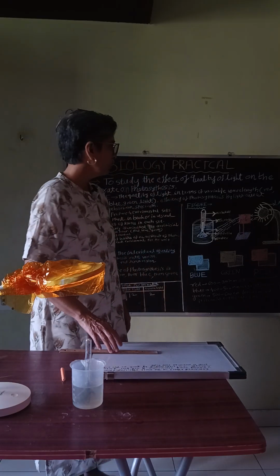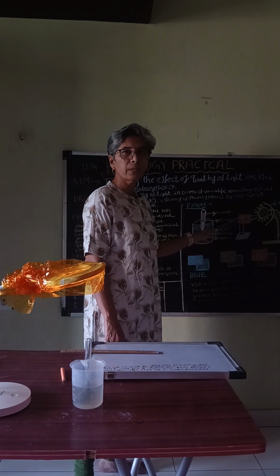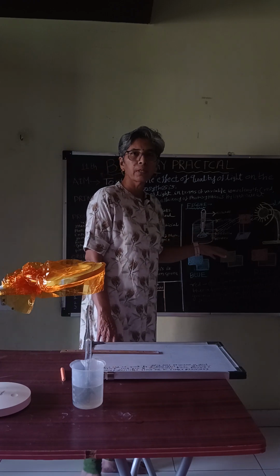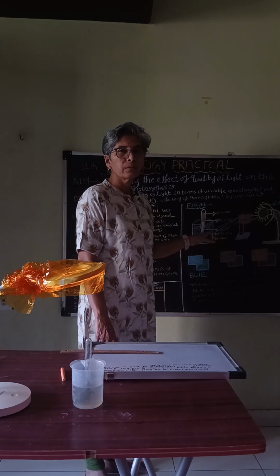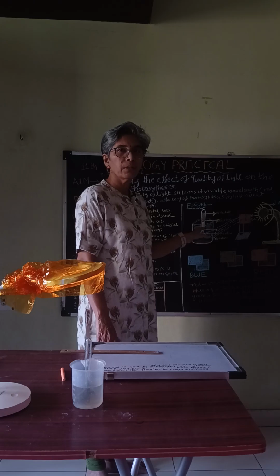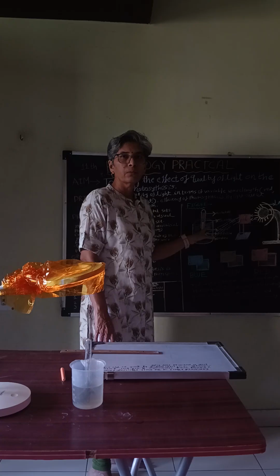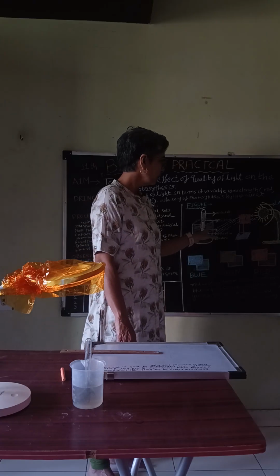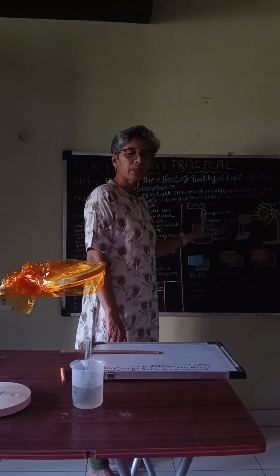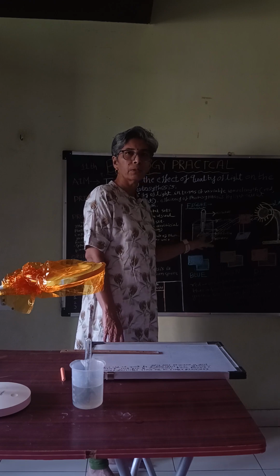So the requirement for this setup is beaker, funnel, test tube, distilled water, KHCO3 solution, potassium bicarbonate. This potassium bicarbonate is added to the beaker to get dissolved CO2 for the photosynthesis process. Due to KHCO3, this hydrilla plant gets dissolved CO2.